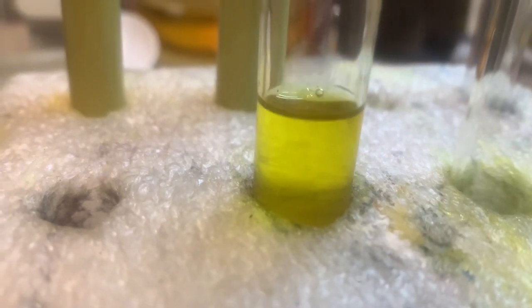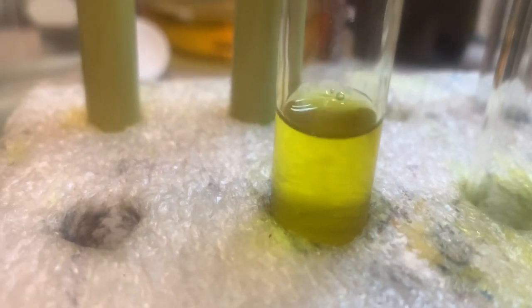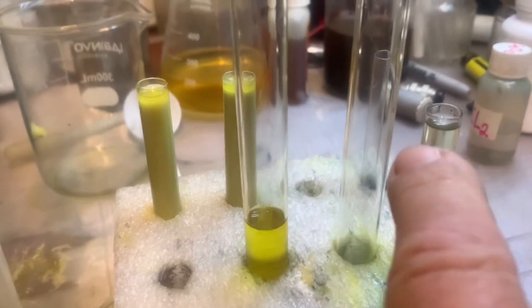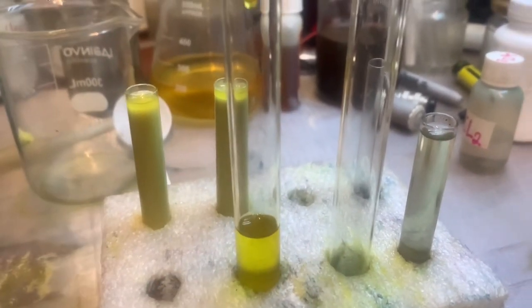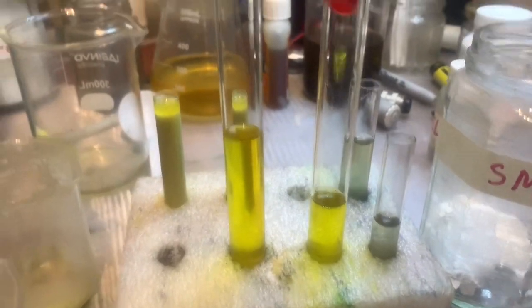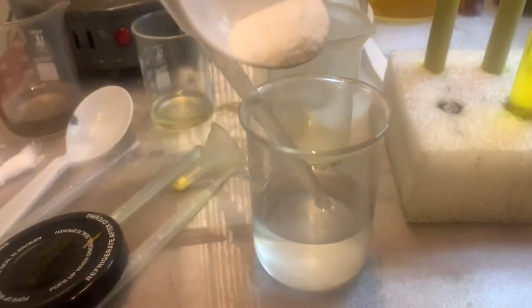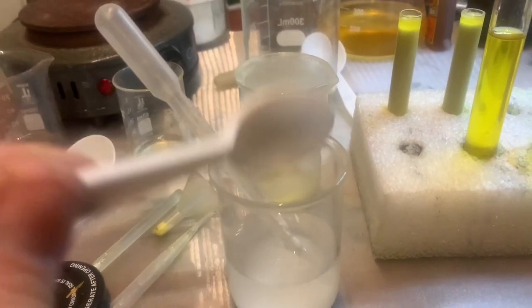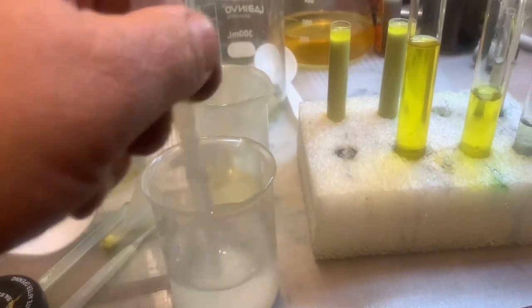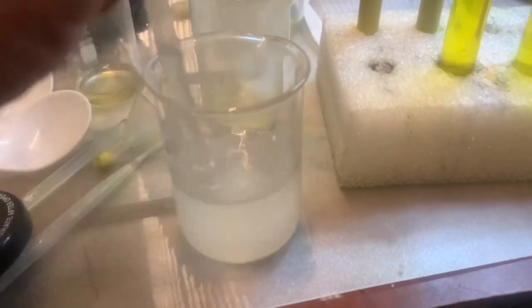Okay, now this looks clean. It's still not exactly what I wanted, but it's already going clean. So after this, when I finish filtrating, I split it in half, and we do precipitation with SMB, okay? Filtrating is almost finishing, very little left, so I'm getting ready to make SMB. I'm putting SMB in the water, like half a spoon, and let it dissolve. Okay? And dissolving in the water.